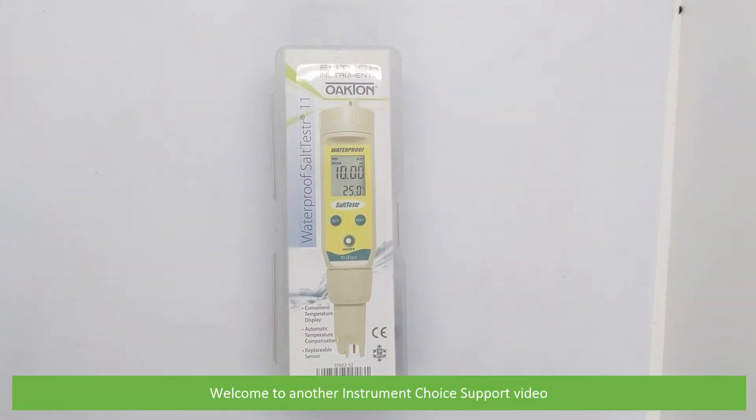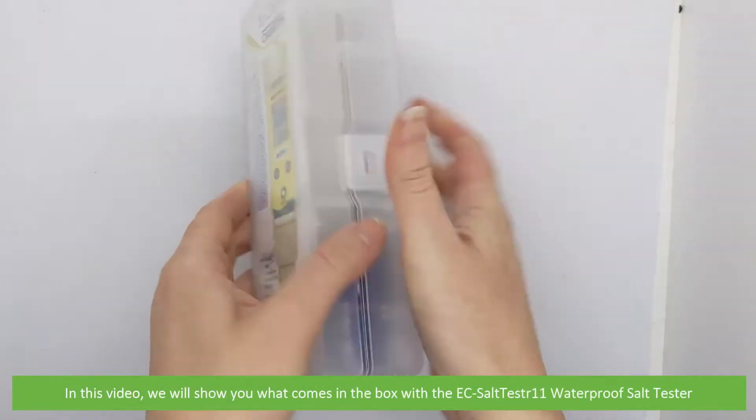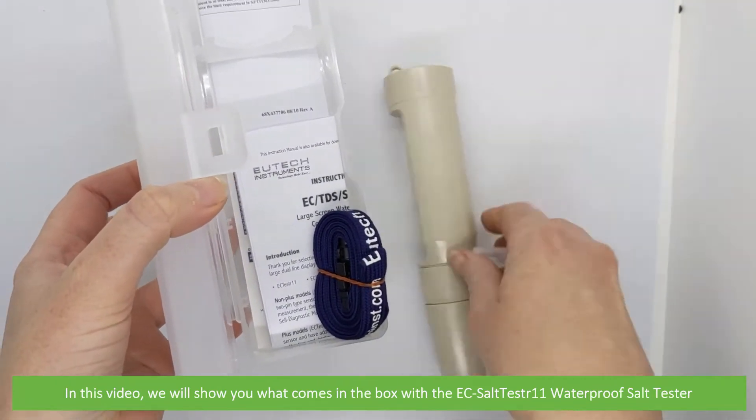Hi and welcome to another Instrument Choice support video. In this video we'll show you what comes in the box with the EC Salt Tester 11 Waterproof Salt Tester.